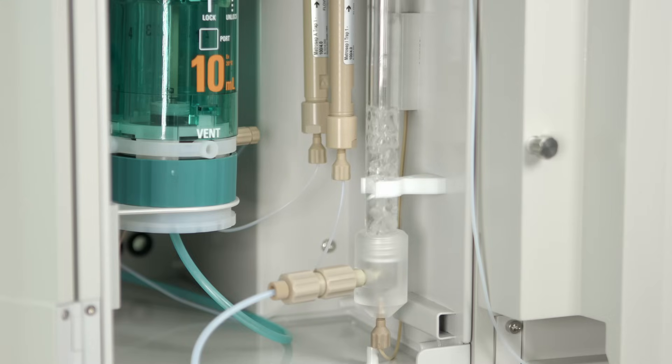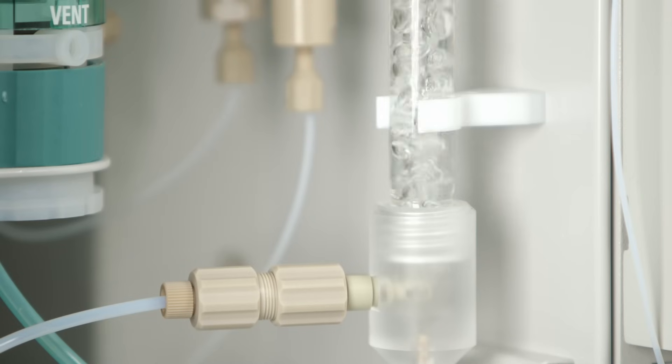The released halogens are then absorbed in ultra-pure water. This step is performed in the absorption module.